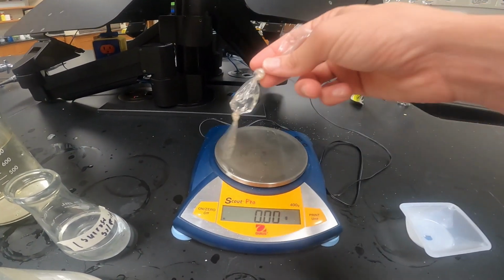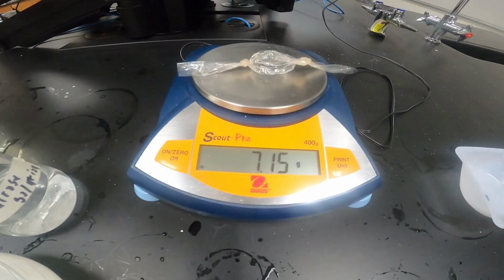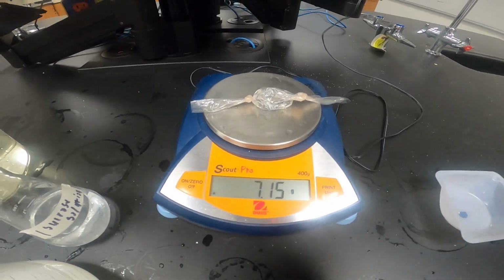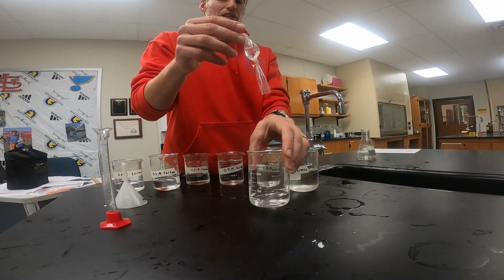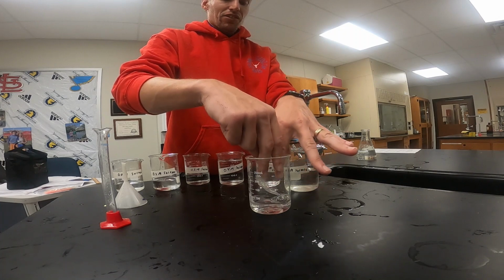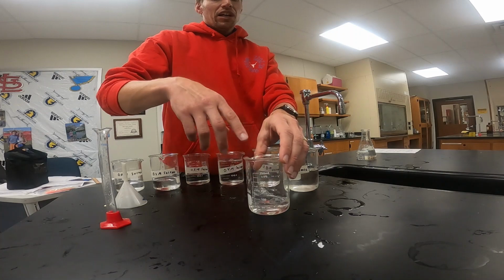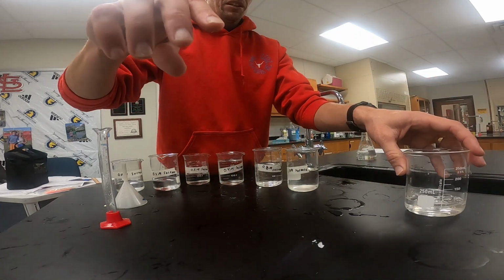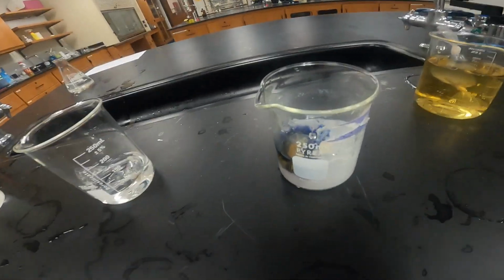So now at the scale, we're just going to weigh our balloon with the 1.0 solution, and we get a mass of 7.15 grams. Now that I have my mass, I'm just going to put my dialysis balloon into our solution, and this time we want to let it sit for 30 minutes. After 30 minutes, we'll take it out, dry it off, and again take our mass. So that one's going to sit for 30 minutes. You can see an update of what's going on with our other balloons while we wait.